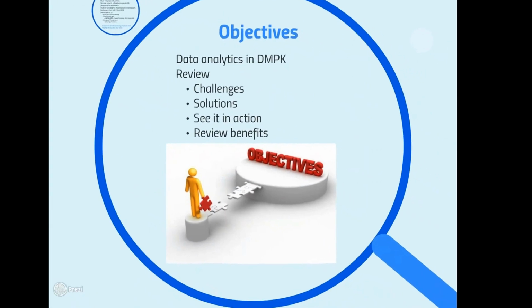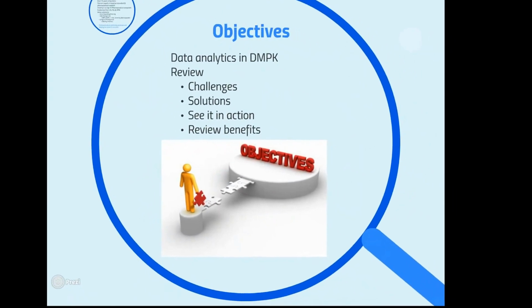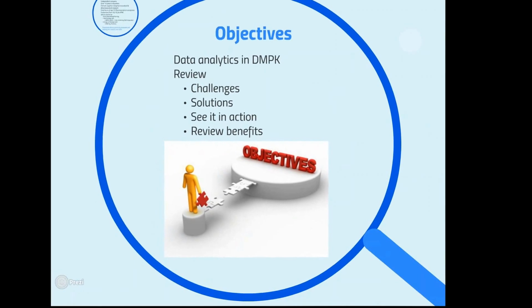So today we're going to go through and have a specific look at our data analytics module for DMPK. We're going to review some of the challenges that DMPK and ADME pose for delivering solutions. And then we'll actually see the system in action, and finally I'll review the benefits before we take your questions.